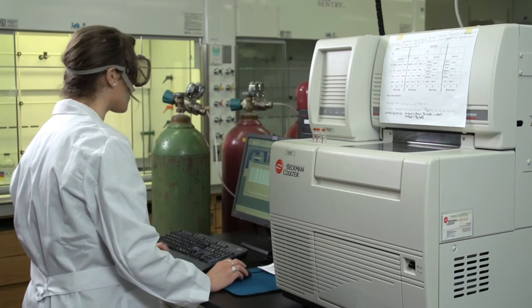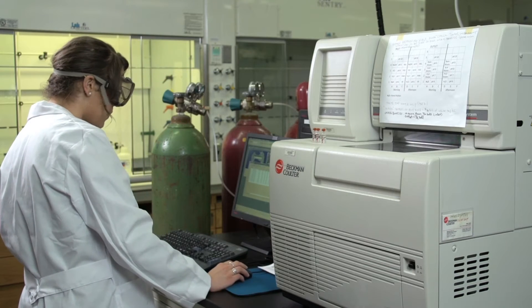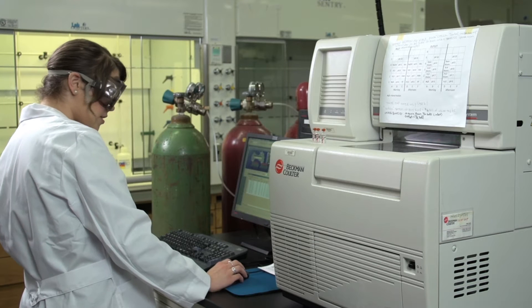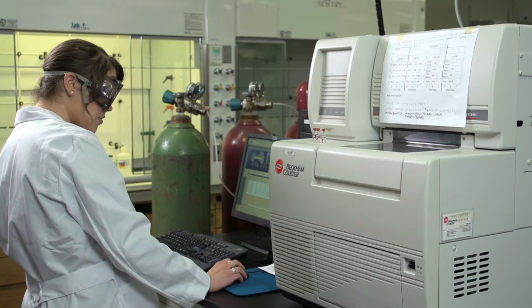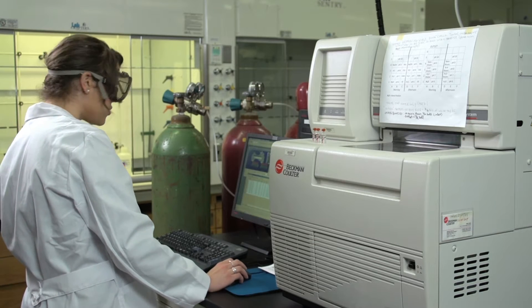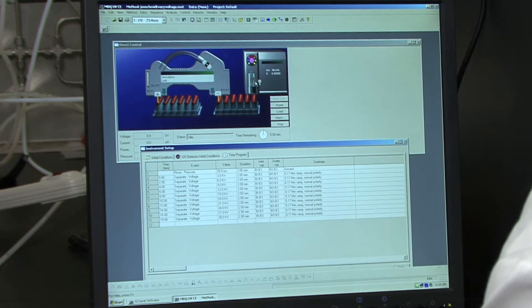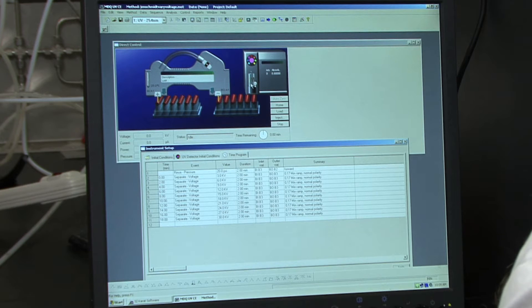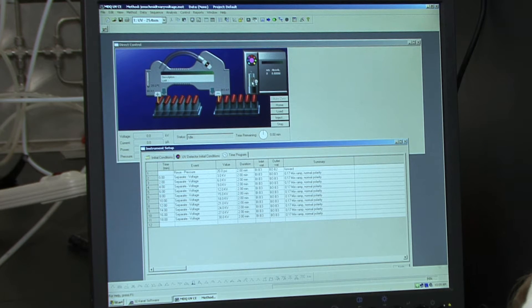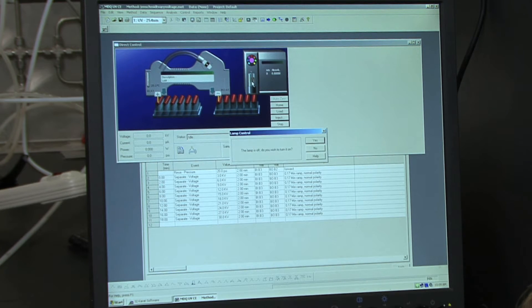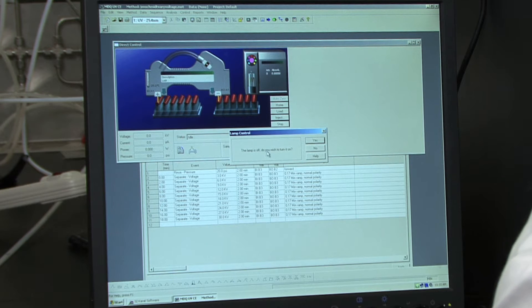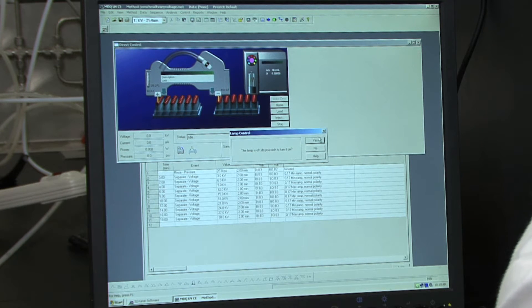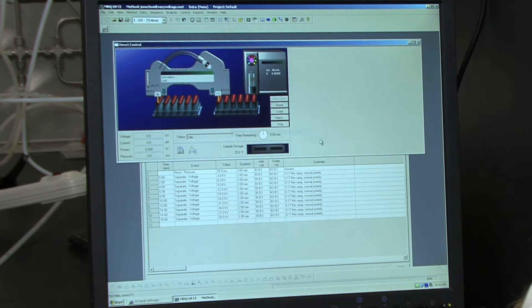Now we have to turn on the UV lamp. So to do this, you just need to move your cursor over the UV lamp in this direct control window and click it on. And when it asks you to turn it on, you say yes.